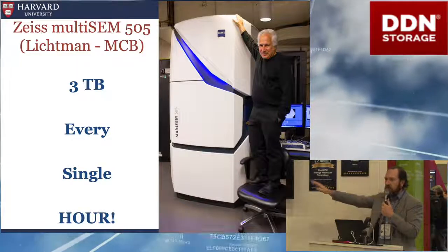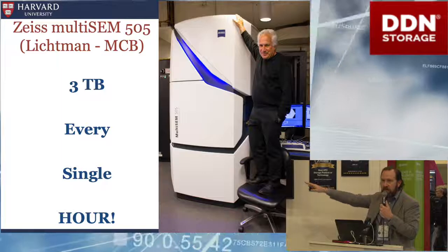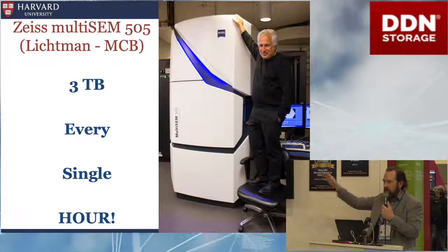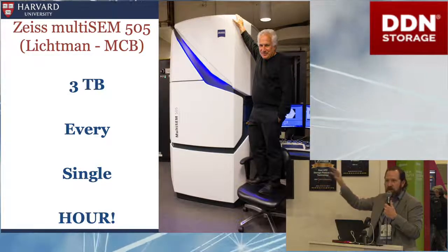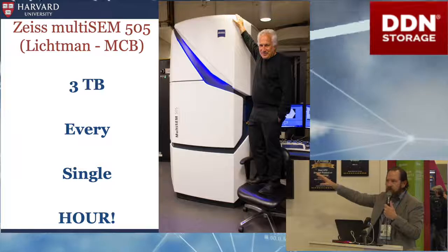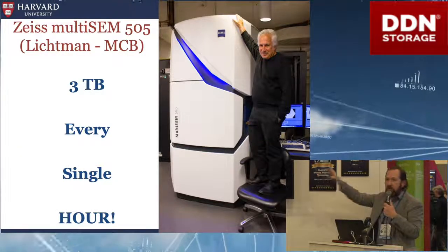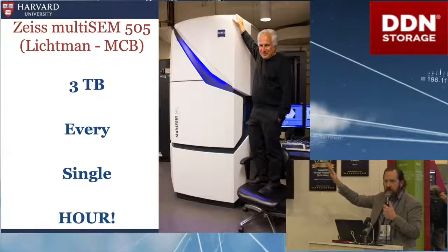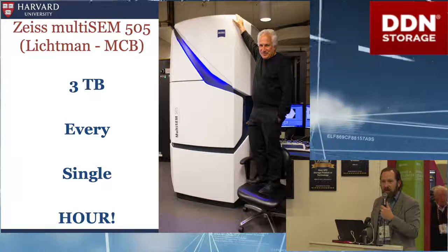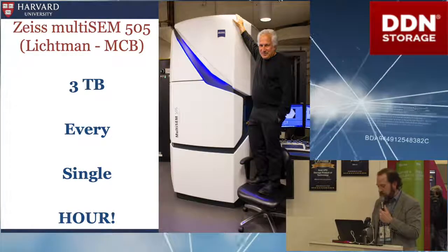So when you talk to people who are doing cryo-EM and they talk about big data, we can almost laugh at them, because this does in an hour what most of them do in a day, right? Or gene sequencing stuff. So this is a challenge to keep up with. This was the first one of the multi-head Zeiss instruments that was in production. That's 61 heads. The current ones are 91 heads. The next ones will be three times that, probably, right? So there'll be almost an order of magnitude change when the new instrument comes out.